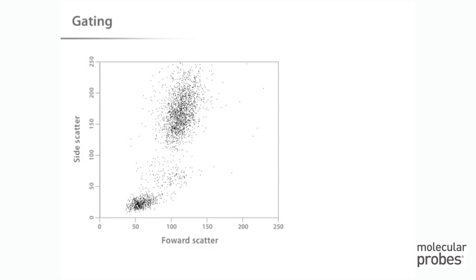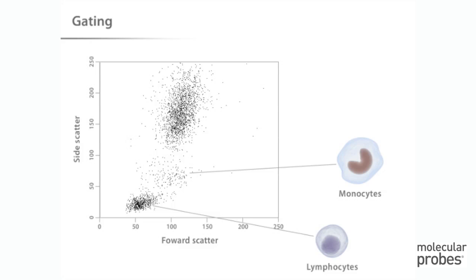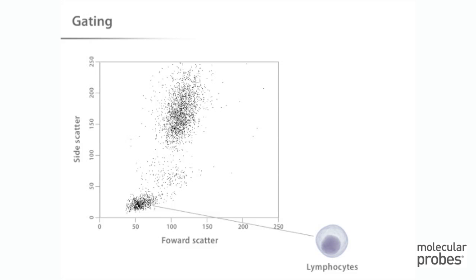Now let's look at data analysis. As we saw in Tutorial 1, it is possible to identify various populations within a cell sample based on their position in the forward versus side scatter dot plot. Remember that each dot on the dot plot represents a cell, and each cell has associated with it all of the scatter and fluorescence data collected at the time it passed through the laser. We can direct the analysis software to consider only the lymphocytes by drawing a region around this population. This is called gating.